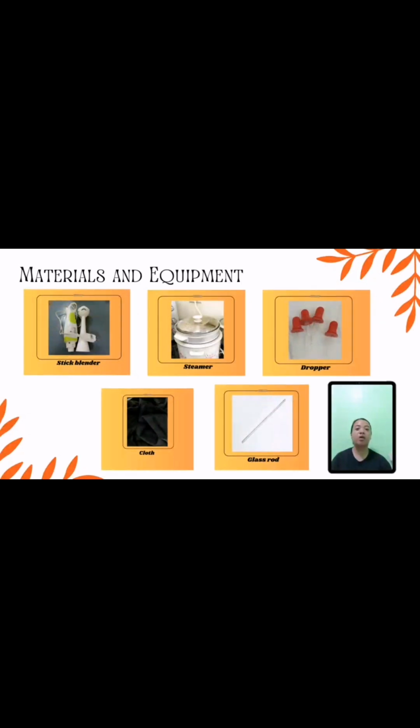I am Christine, and I will discuss the materials and tools we use in our laboratory soap making. So, the first thing we have here is the immersion or stick blender, which is one of the most important tools needed for the hot process in soap making. This is the tool that we use to transform the oils and lye water solution into a beautiful emulsion.